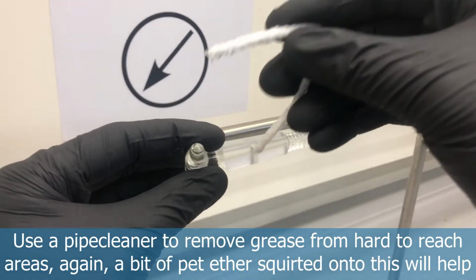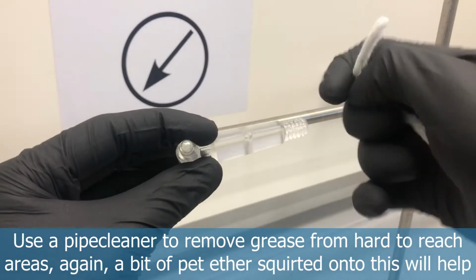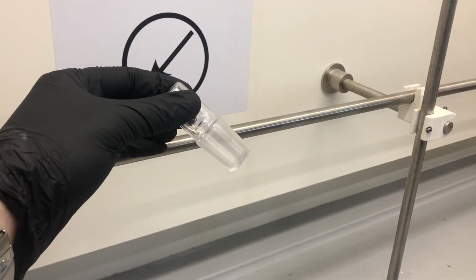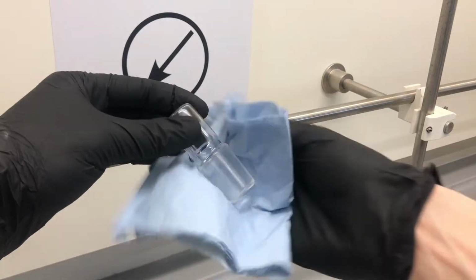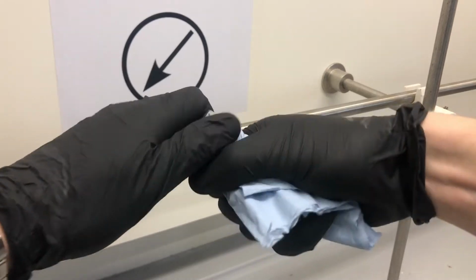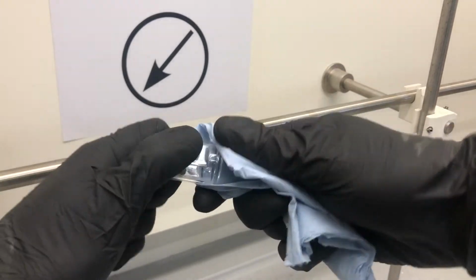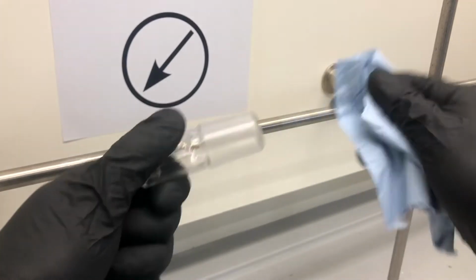And in any hard to reach places which the blue roll won't get, we need to employ our pipe cleaner, chucking it in there, maybe putting some pet ether on there as well, and that will dissolve up the grease. So again, with our stopper, wiping this with some blue roll, maybe some pet ether, and you should be able to touch it afterwards and not feel any grease. It's good to just make sure that we check before we move on to cleaning other parts.